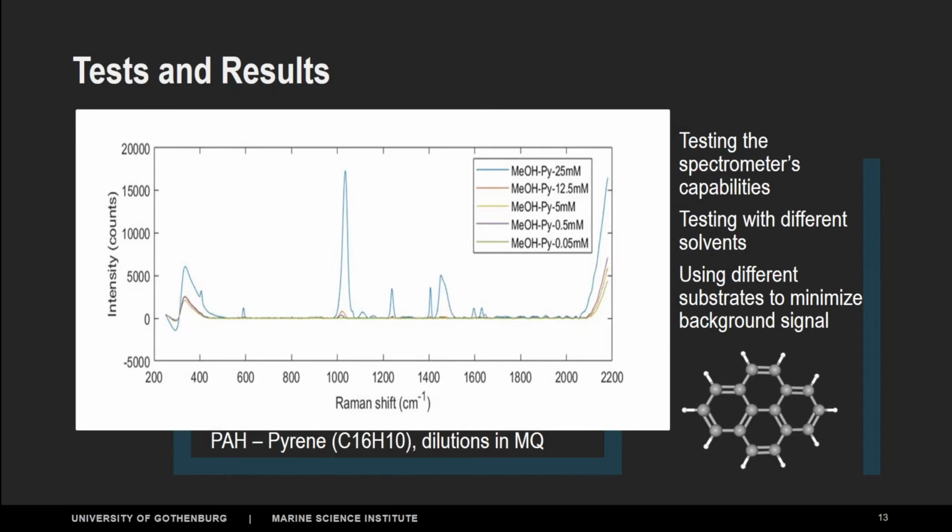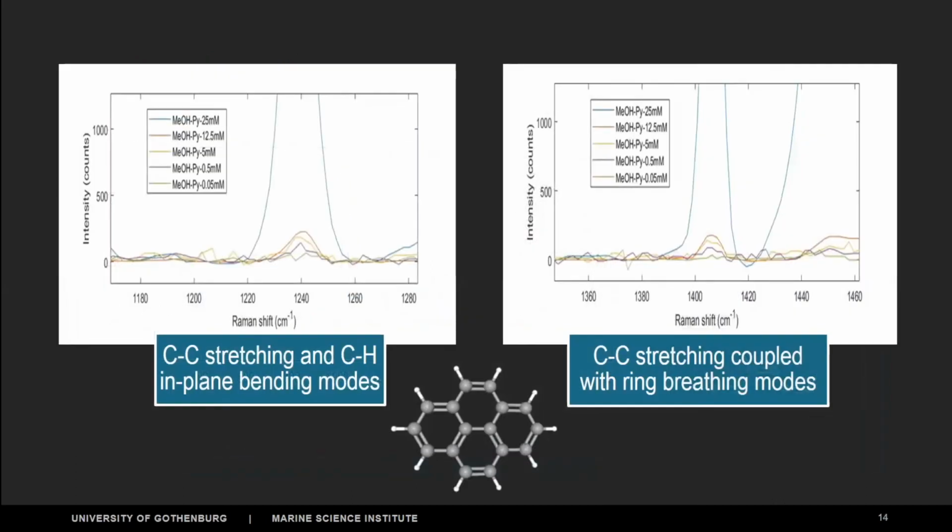The spectrometer itself does very well if you want to analyze high concentrations. But if we want to go down in concentrations, then we have to think differently. Again, this is zoomed in on the peaks with basic processing on the data, and you see those peaks, which are created by what's happening in the molecule giving you the signal.